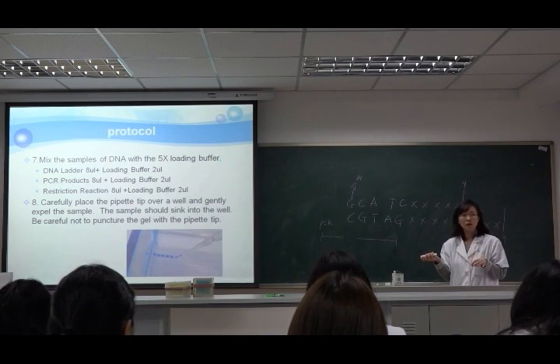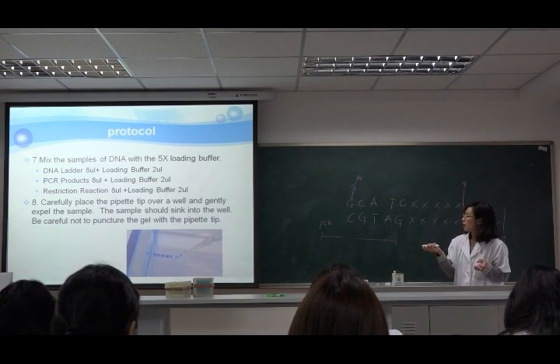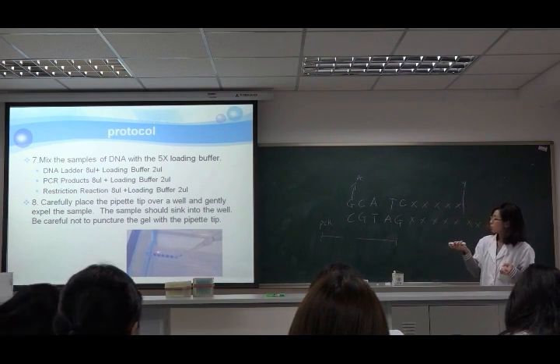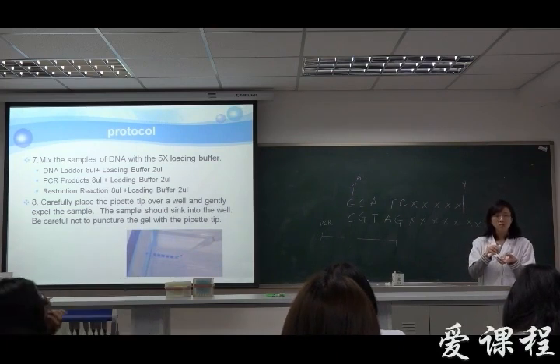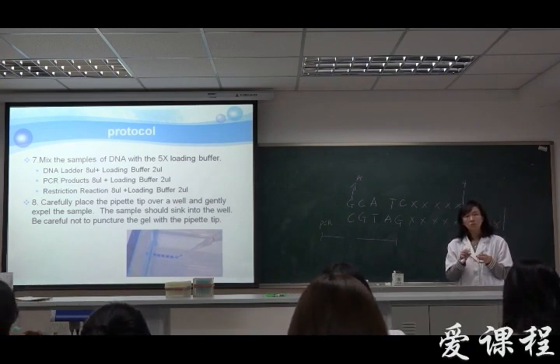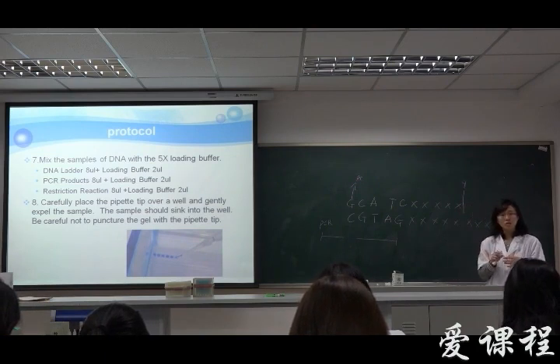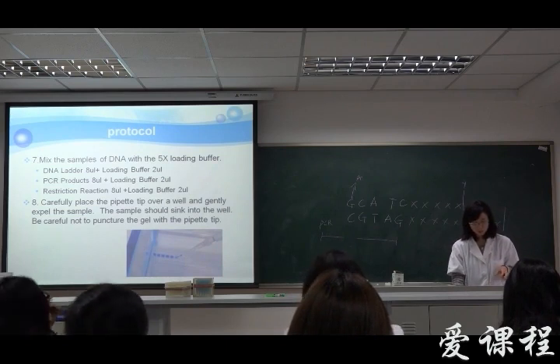We should make sure all the product is put into the wells, and the sample will sink into the well. Be careful, do not puncture the gel with the pipette tip. That means do not touch the gel with the tip. We just put the solution into the well, however we cannot touch the gel with our pipette tip. This is what you will do here.